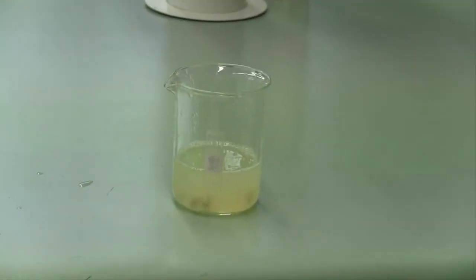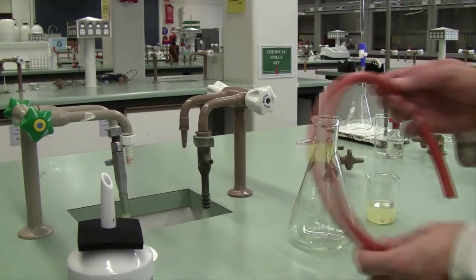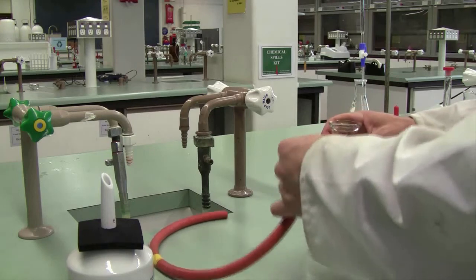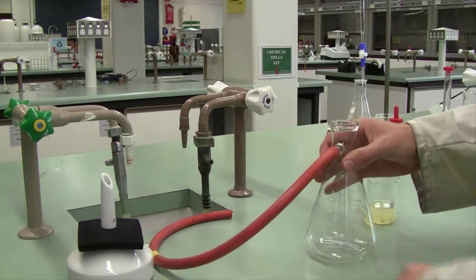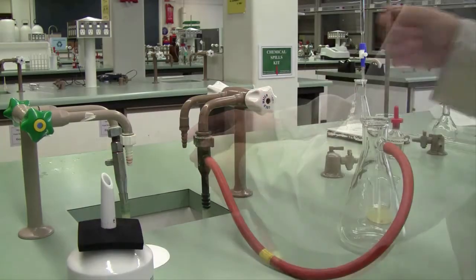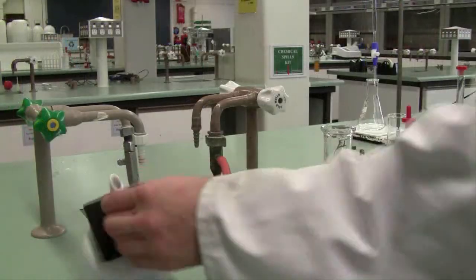First, taking a look at the lemon juice, we can see it's full of pith and pips — it needs to be filtered. We're going to be doing that by vacuum filtration. Take a piece of vacuum hosing labeled with yellow tape, attach one arm carefully to the side arm of your vacuum flask, and the other to the side arm on the water tap. Place your funnel in the top of your vacuum flask.